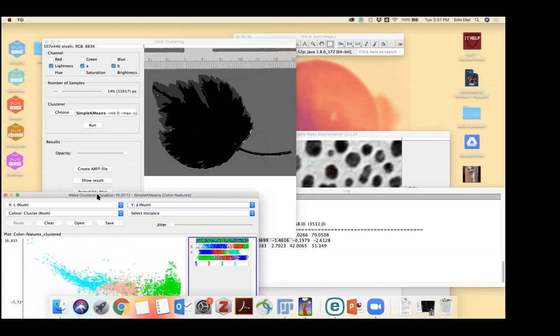So it's an unsupervised method. It's slightly supervised because you're providing the number of clusters, but you're not providing that training data to segment the image. And so Weka is really nice for that reason, because it hasn't predetermined what clustering you want to use. It provides you, probably overkill, too many options for classifiers. And so you can go with the tried and true, or if you have some interesting different data, maybe the tried and true doesn't actually work so well. And so you have all the options in the world to choose a classifier that's appropriate.